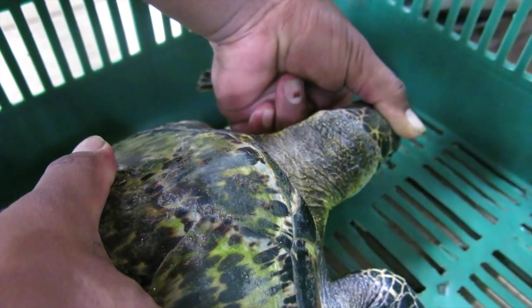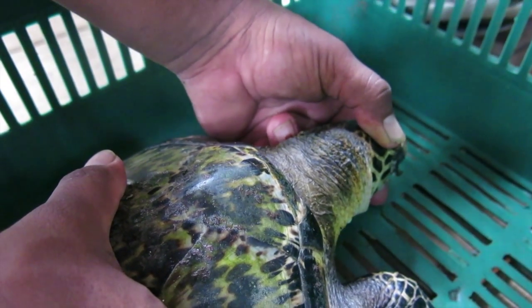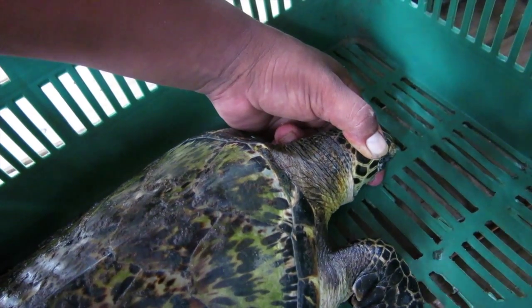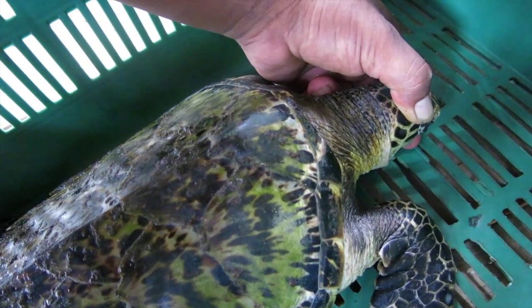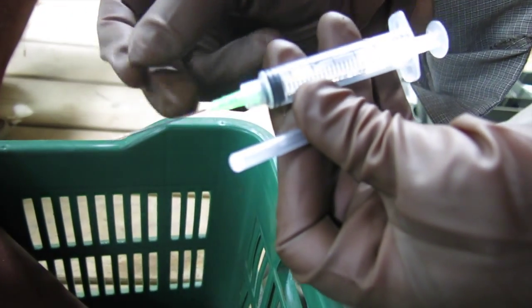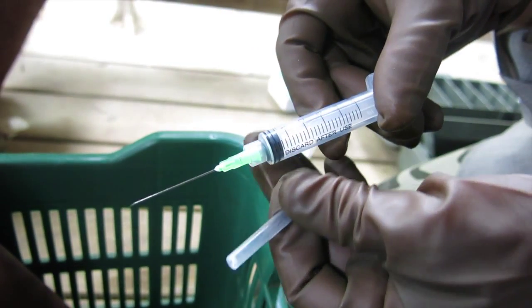Then we'll go right away with our needle. The needle we're using is a 21 gauge, one and a half inch needle — it's actually a 5 mil syringe with a 21 gauge one and a half inch needle.